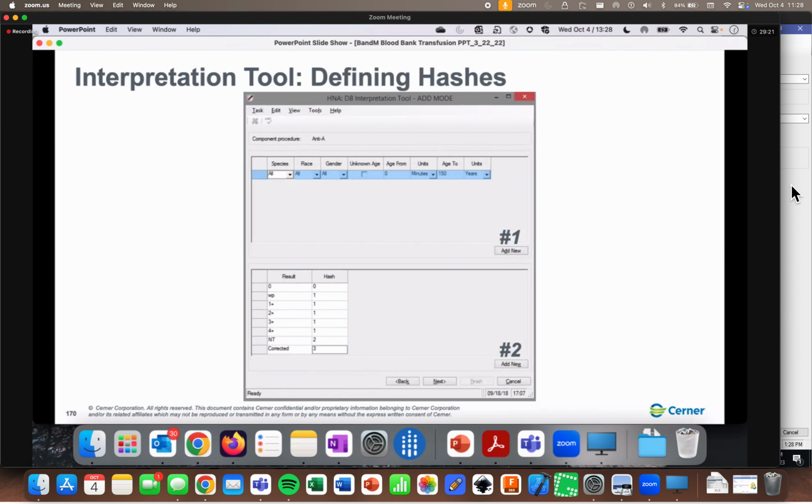So this would make up the third of the top 3 most confusing parts of our interpretation. And that is hashes. People get so confused by the concept of hashes. And thank goodness I understand, and I can go ahead and clear up some of the confusion here. But first, before we get into the hashes themselves, we have the top portion.